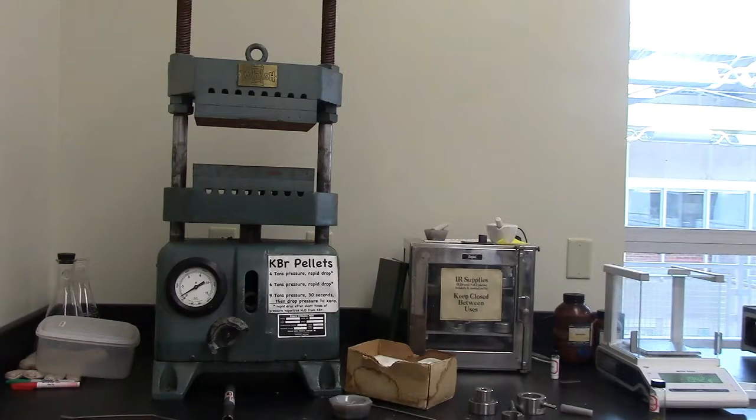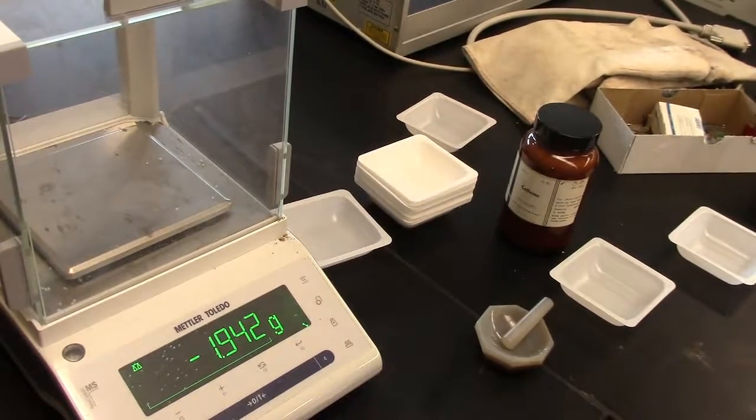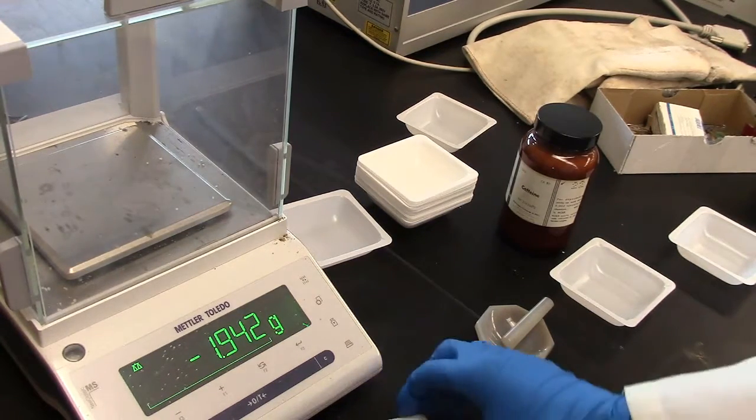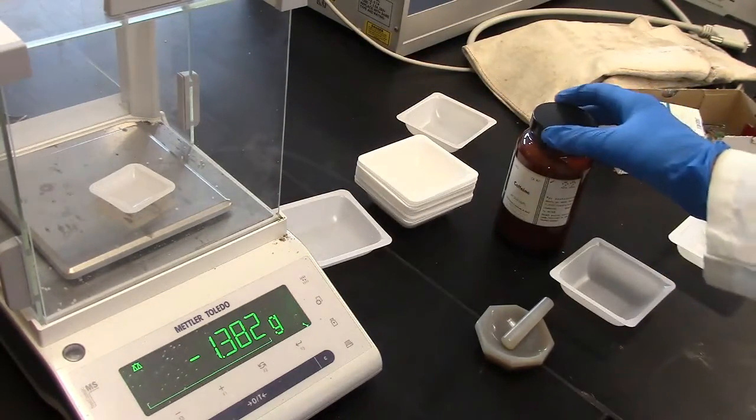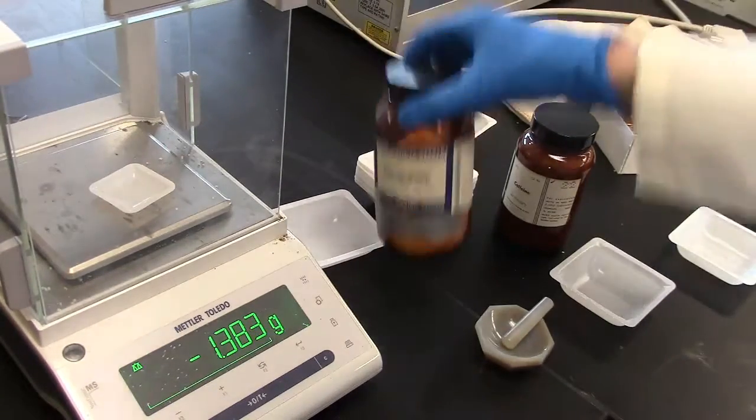The first thing we'll need to do in order to use the IR is to make a KBR pellet of our substance. The first thing we'll need to do in order to make a KBR pellet is to weigh out approximately 100 to 200 milligrams of potassium bromide or KBR.